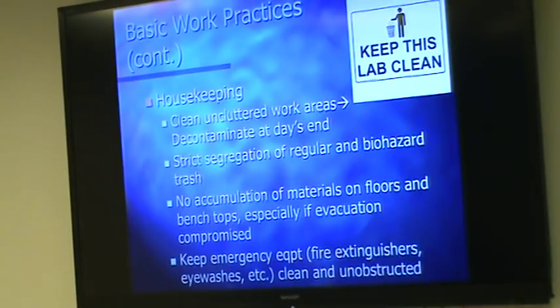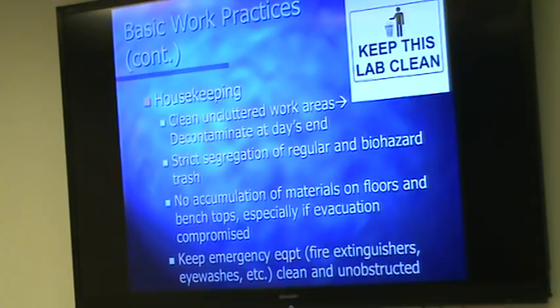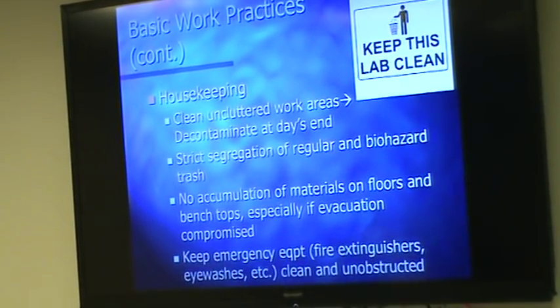People that are new may not completely know what that is. So is it in a red bag, an orange bag? The stuff that tends to accumulate is stuff that hasn't been put away, or that you'll get back to. If it's accumulating in walkways, near fire extinguishers, near the eye washes or the safety showers, that's a really big problem. It might just be unsightly in one place, but if it's truly blocking safety equipment in another, then it's got to be picked up and put away, because that needs to be kept unobstructed.